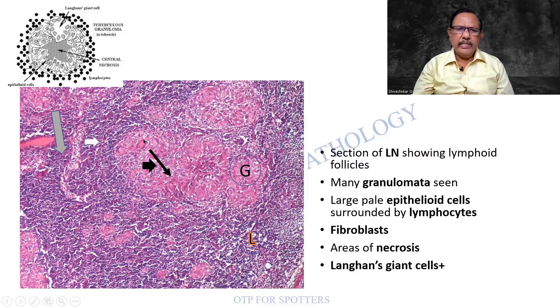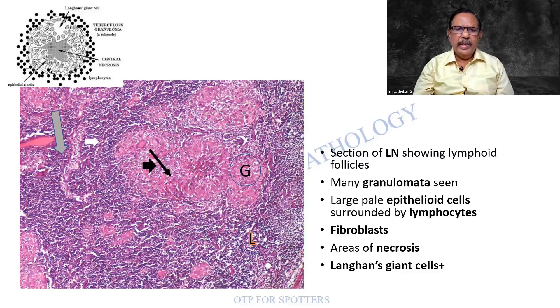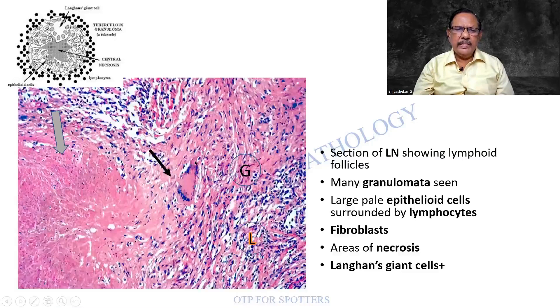Look at this one — there is a peripheral nucleus. The cells are all pale and they are called epithelioid cells. Multiple granulomata, epithelioid cells, lymphocytes — there will be fibroblasts in the periphery, areas of necrosis, and Langhans type of giant cells that I am seeing.